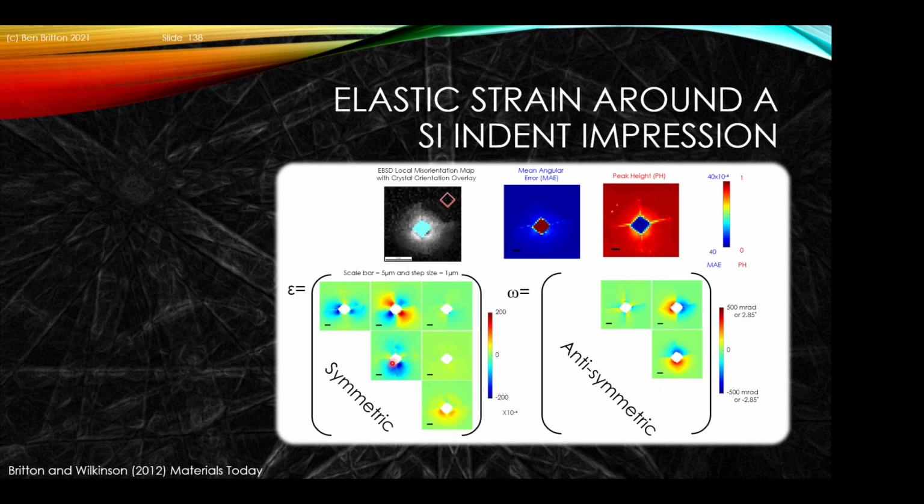You have a compressive strain field along the y-axis in this sense. You have a tensile 1-1, so horizontal strain along this axis, which forms cracks in the material. It's lesser in magnitude because it's cracked and released that tensile stress. The shear is a bit more hard to work out, but it is true, this variation. And you can also get the out of plane strain with a bit of cleverness, and that shows you effectively that the material is under tension at the surface, which is important for lots of reasons in this problem.